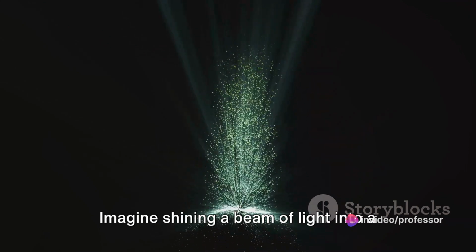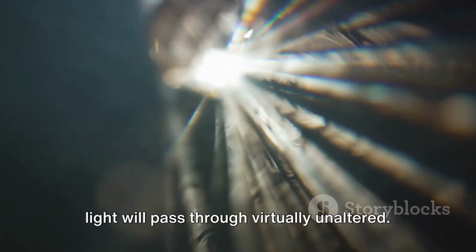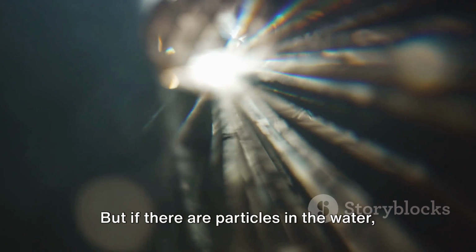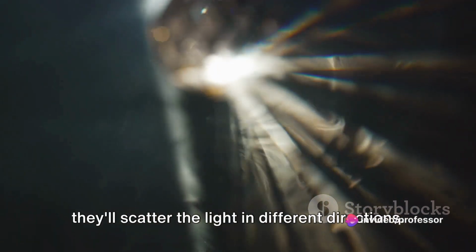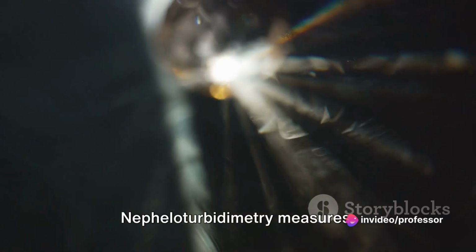Imagine shining a beam of light into a glass of water. If the water is perfectly clear, the light will pass through, virtually unaltered. But if there are particles in the water, they'll scatter the light in different directions. This scattering is what Nepheloturbidimetry measures.